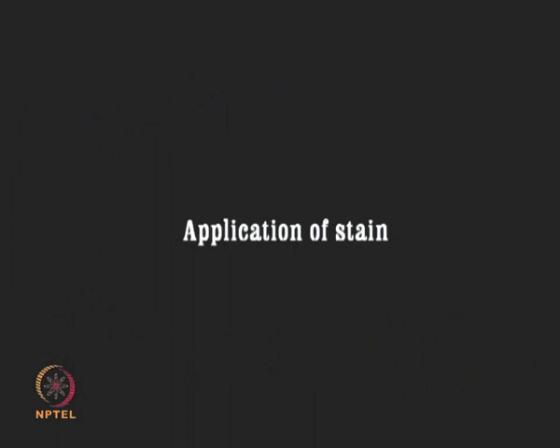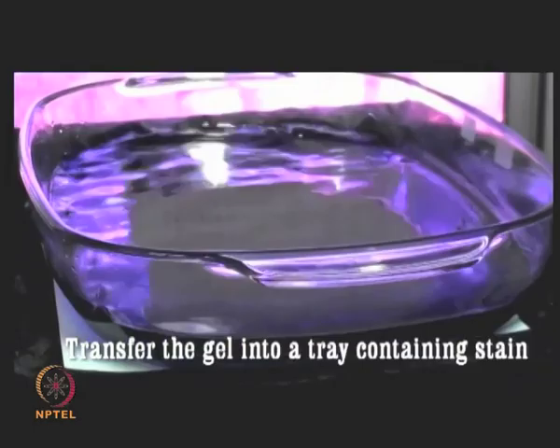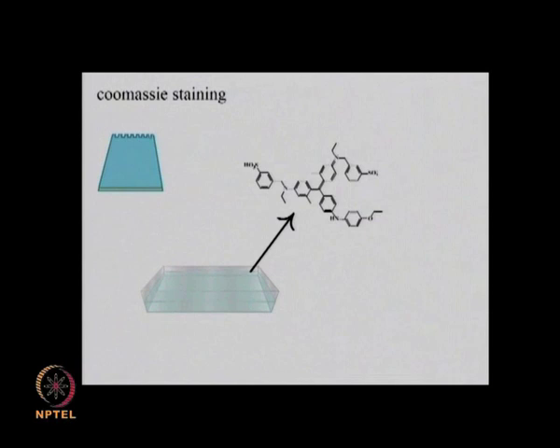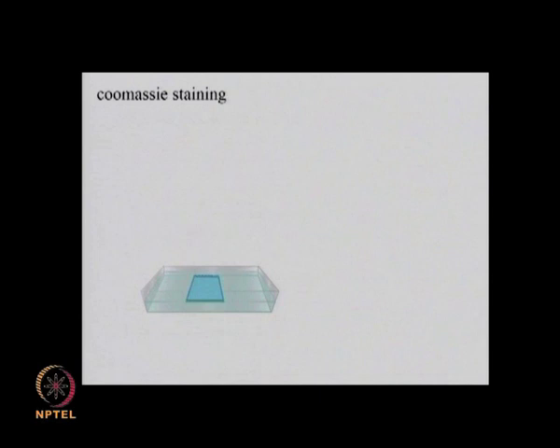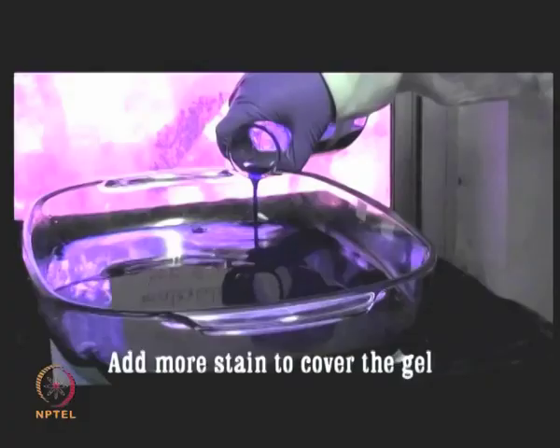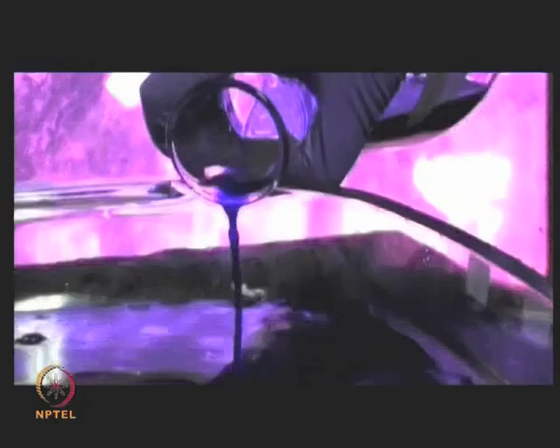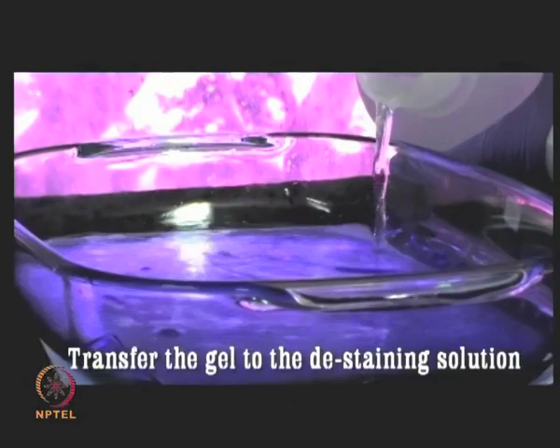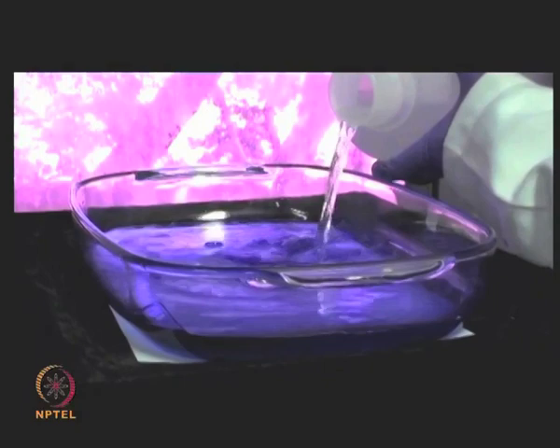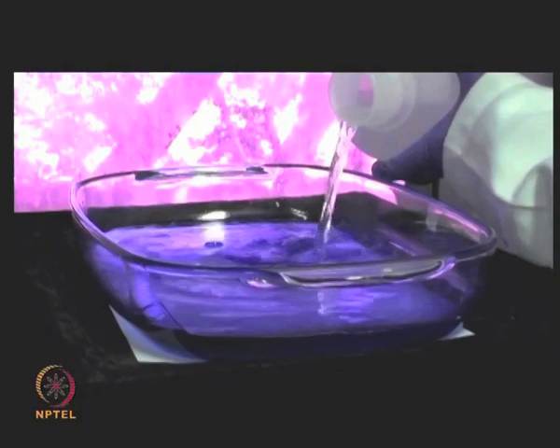Gel staining: transfer the gel carefully into another tray containing the Coomassie blue staining solution and place it on the shaker to ensure uniform contact of the gel with the solution. The negatively charged Coomassie dye interacts with protein through ionic and other non-covalent interactions, thereby staining them with a blue color. Add some more staining solution such that the gel is completely immersed and leave it overnight for around 8 to 10 hours. De-staining: drain out the staining solution from the tray and pour the de-staining solution consisting of methanol and acetic acid into the tray. Place the tray on the shaker for around 6 to 8 hours until the background stain of the gel is completely removed and the spots are clearly visible.